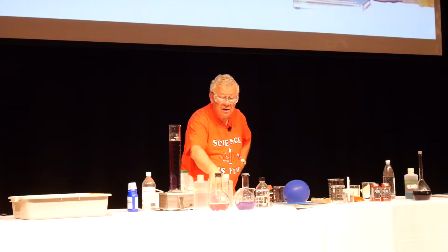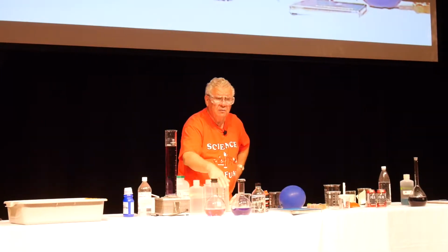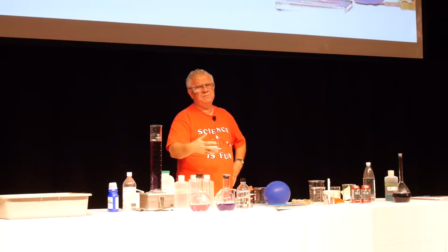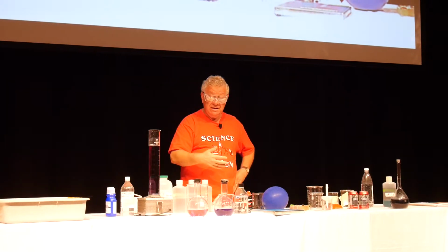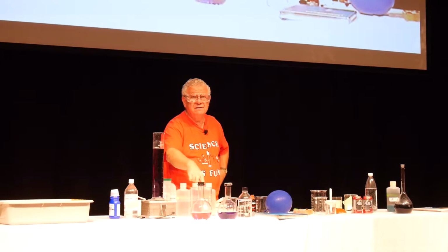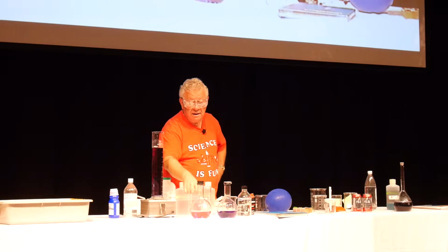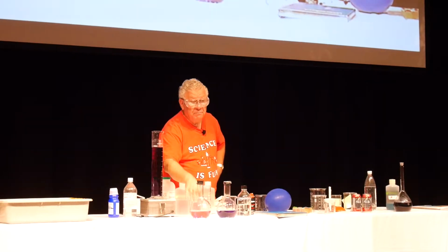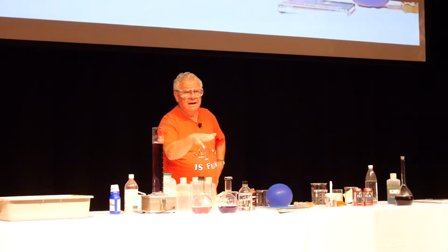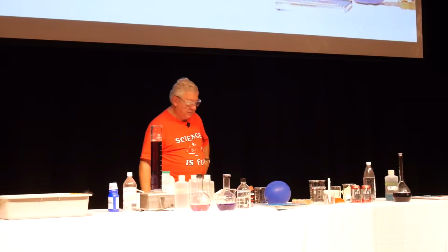And what's above the liquid, you notice that the flasks are stoppered. What's above the liquids is air. Air is a mixture of nitrogen and oxygen, about 20% oxygen and 80% nitrogen. And it's the oxygen in the air that's reacting that gives us the color changes. And the reactions are taking place where the oxygen combines with the dextrose, and the indicators catalyze the reaction. So we can watch those a little bit and see what else happens.